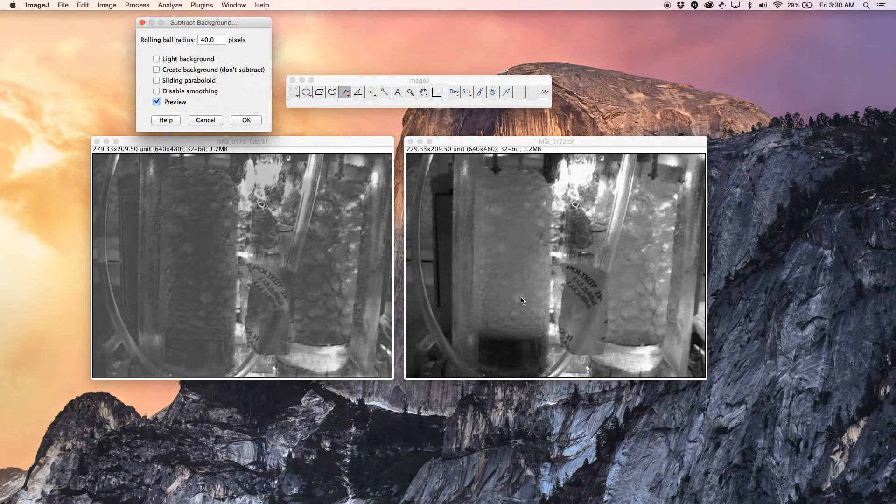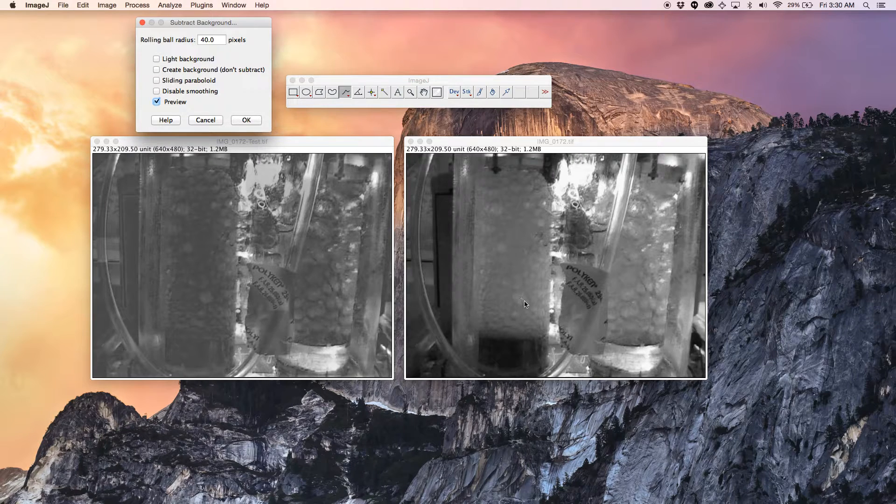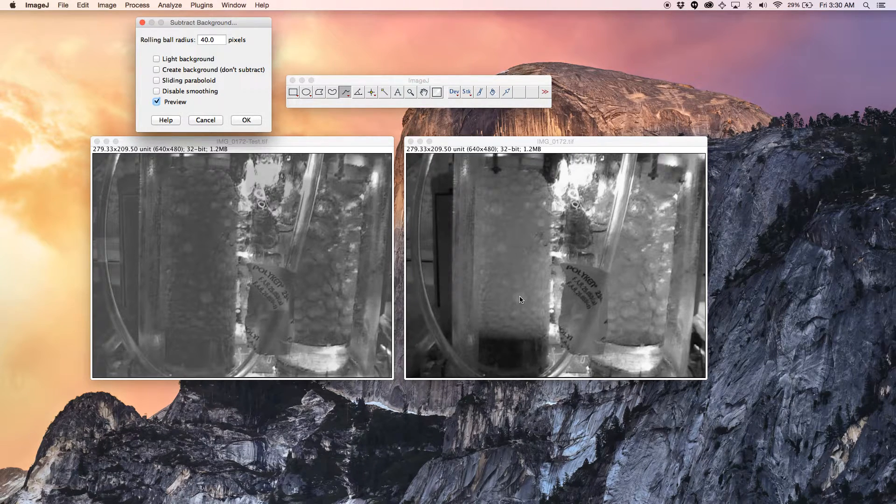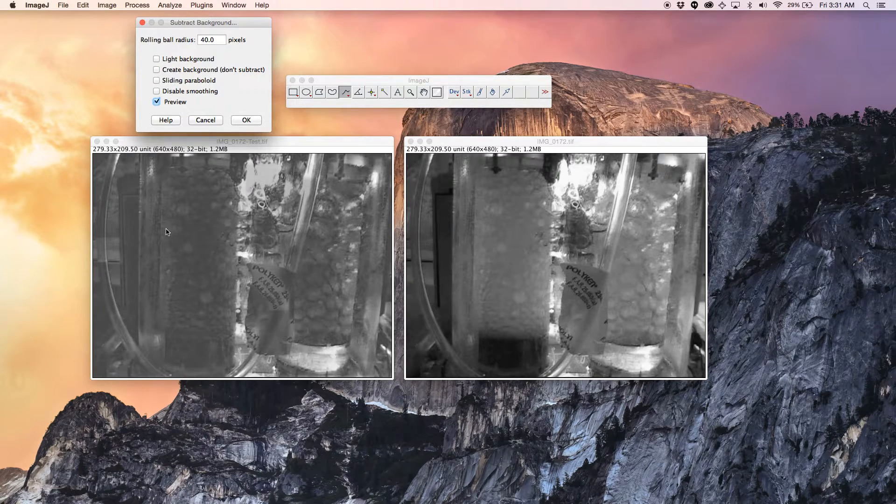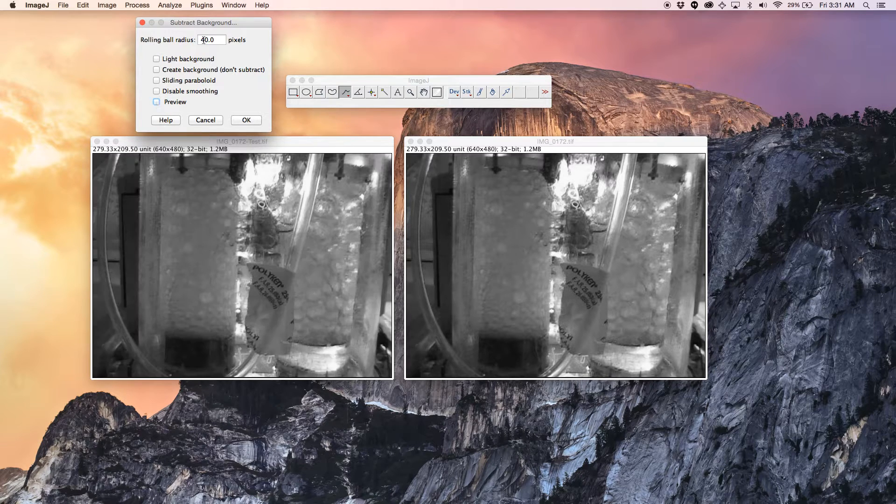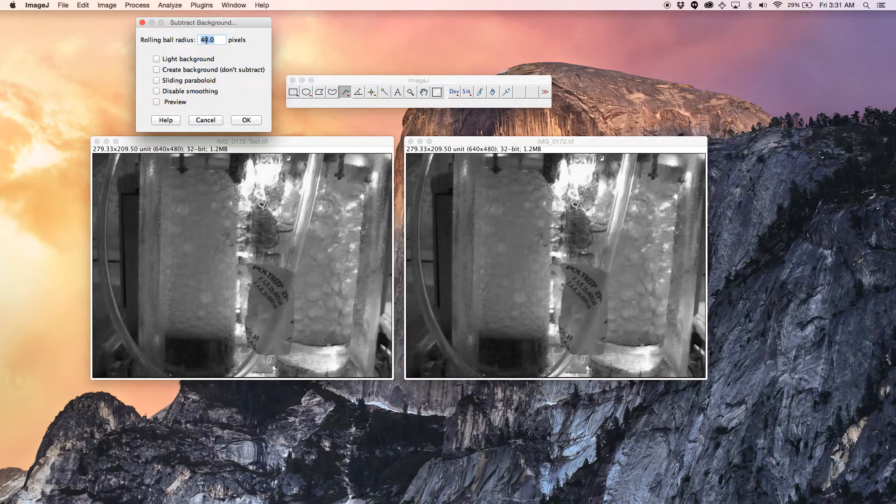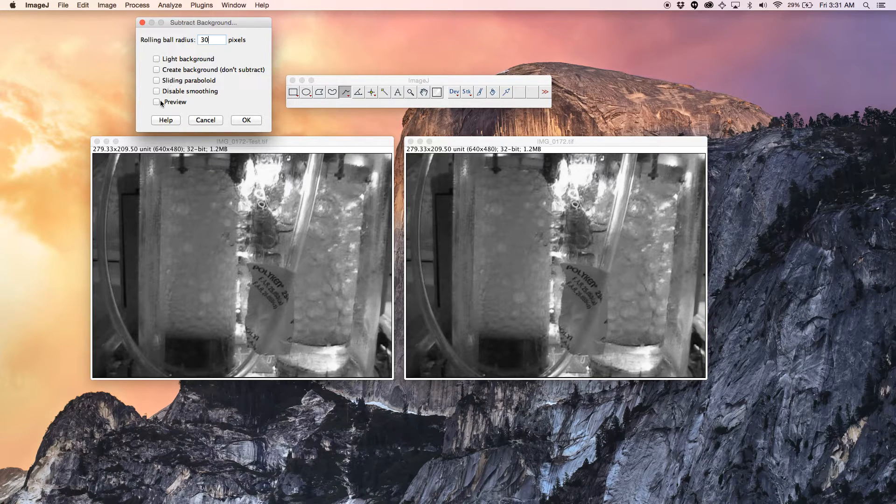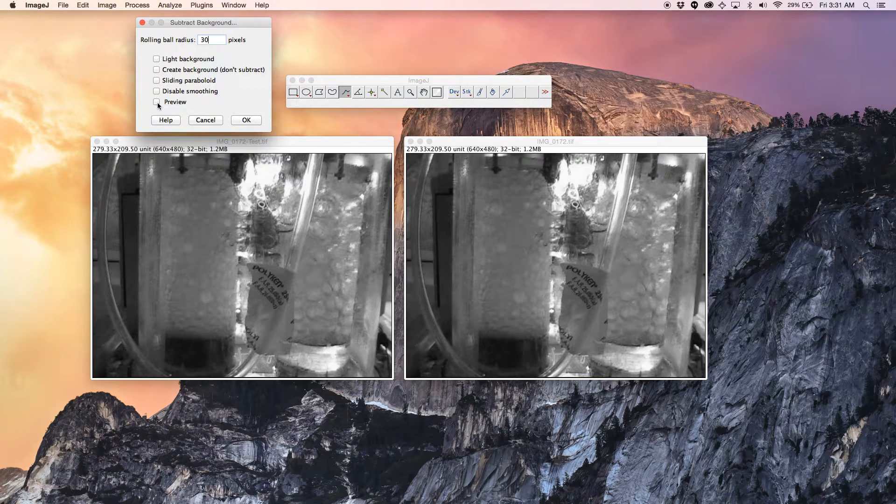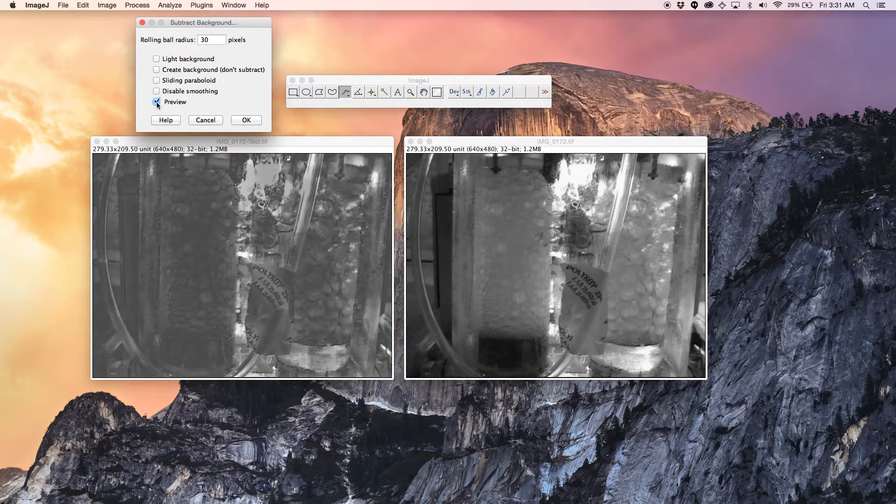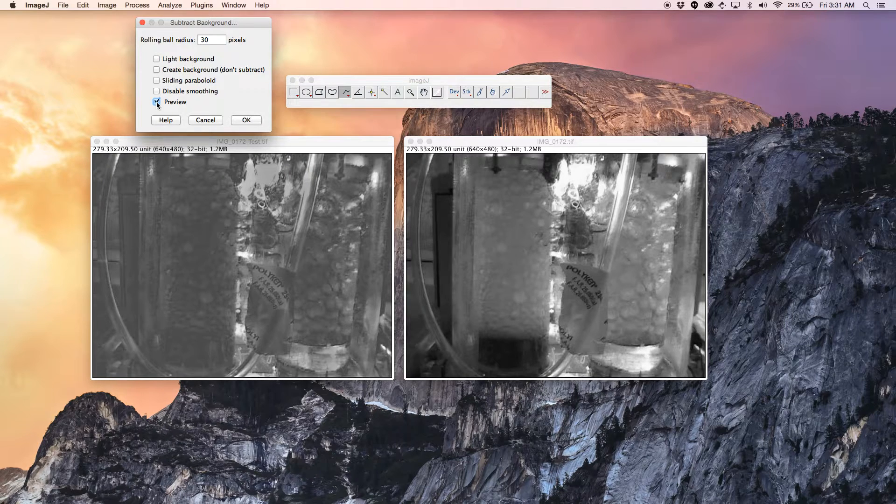also keeping your test case or the copy of the original image to compare. So let's change the value to 30 pixels. Rolling ball radius and do another preview. It's much better.